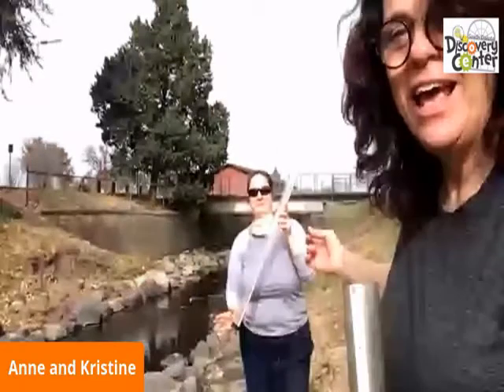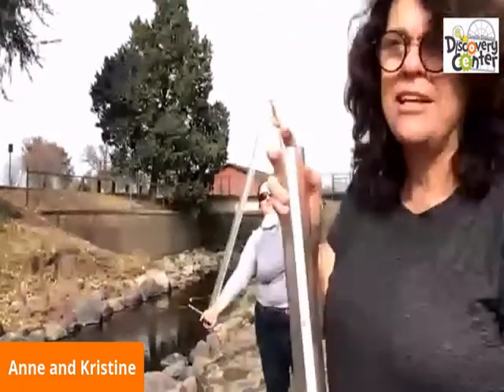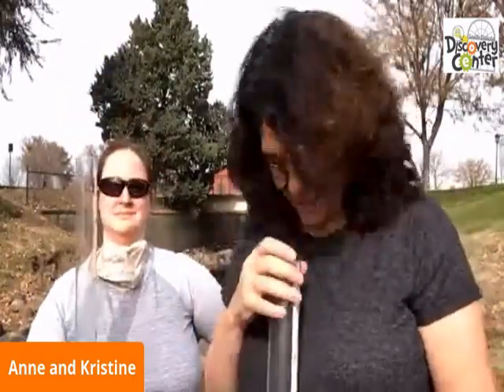I'm going to show you another T-tube, or Chris's. This one's really big. It's twice as big as this one. This one's 60 centimeters. That's 120 centimeters or 1.2 meters. If you were to go to the Black Hills, you could fill this all the way to the top and look down, and you would be able to see the black and white pattern at the bottom, even with it filled all the way to the top.